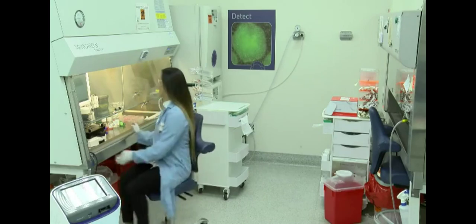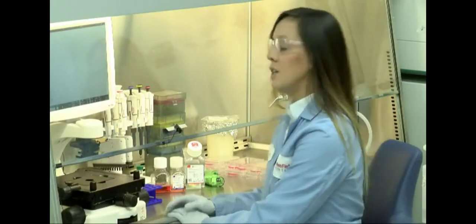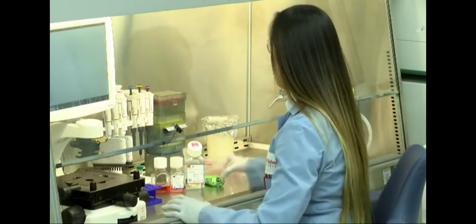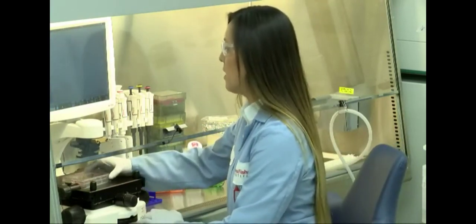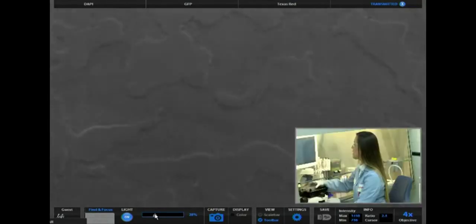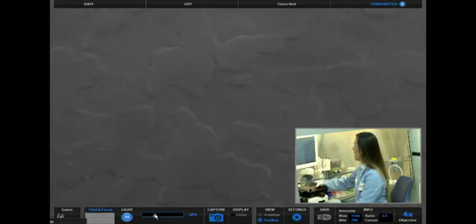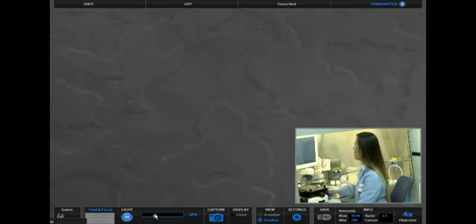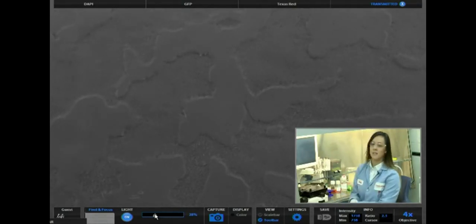So let's get started. The first thing we're going to do is neural induction using our neural induction media. So we have a starting cell type over here on the EVOs. If we look at this image on the EVOs, this is our starting PSCs. They're about 70 to 90% confluent. What that means is that the colonies are pretty much touching each other, but they're also very clean. So this is a feeder-free culture without spontaneous differentiation.